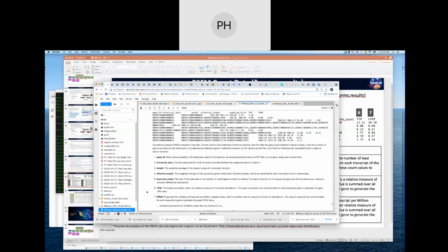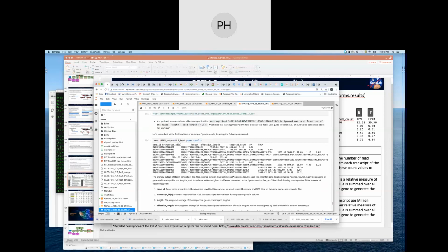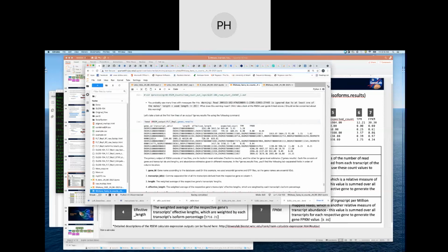So I'm just going to pull out the counts here just to show you the example of some stuff. Let me make this bigger for us.